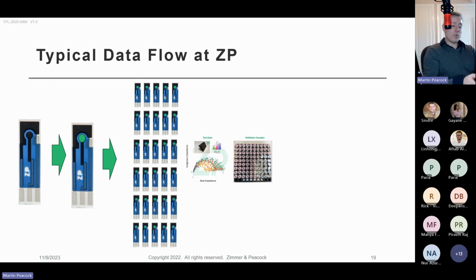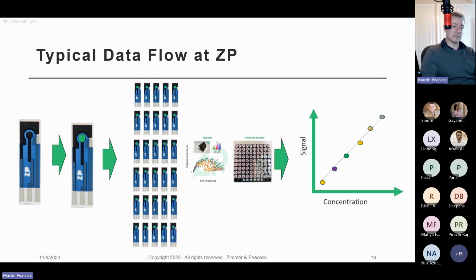So our workflow, I mean, the title of this webinar is Data Science for Biosensor Developers. So if it's an in vitro diagnostic, we'll often start with the screen printed electrode. We're obviously biased, we're using our own. Because of the circular electrode, it's easy to fabricate. And then if it's a simple one-step process, then it's just pipette, pipette, pipette. If it's a two-step process, then it'll be pipette, dry, then pipette, then dry. So it becomes longer to do that. But we aren't gathering small sets of data. We're actually gathering quite large sets of data.